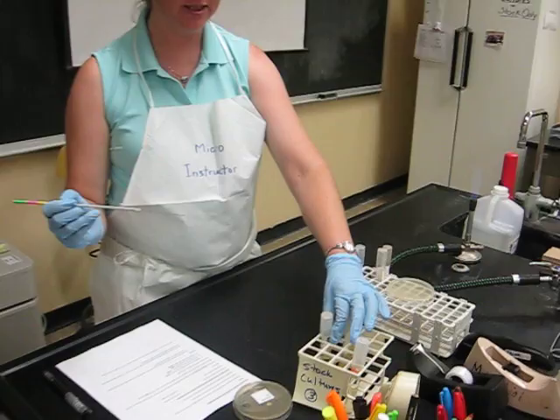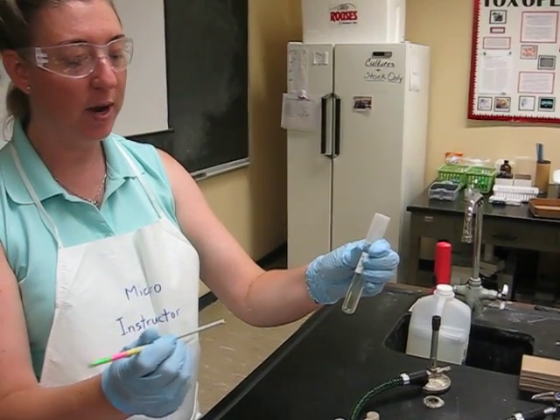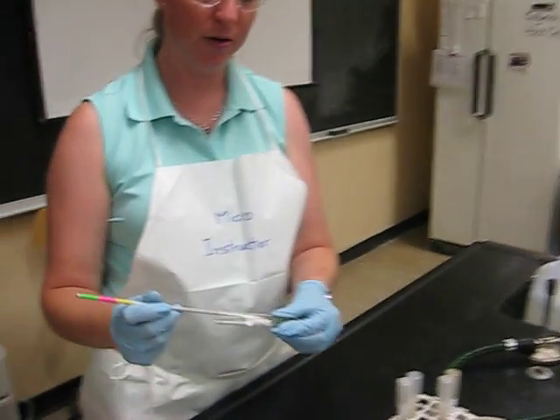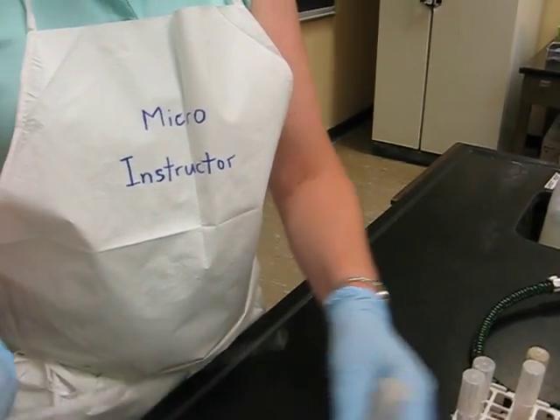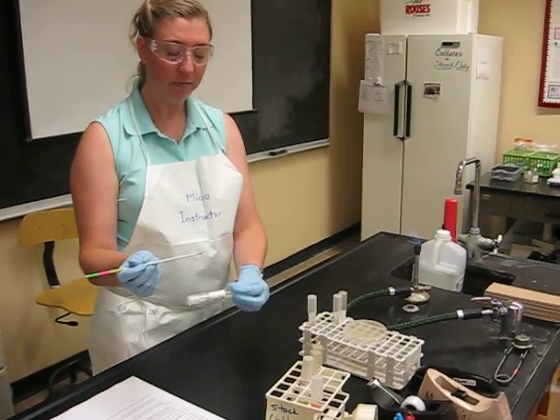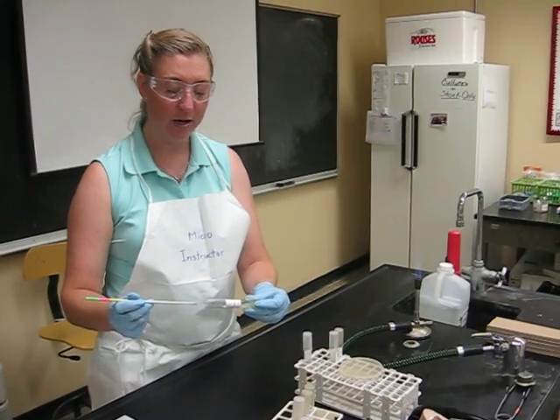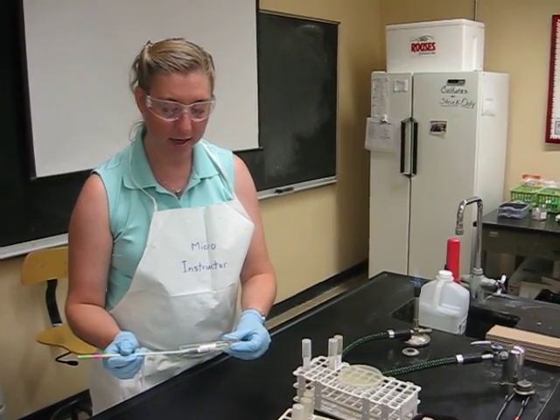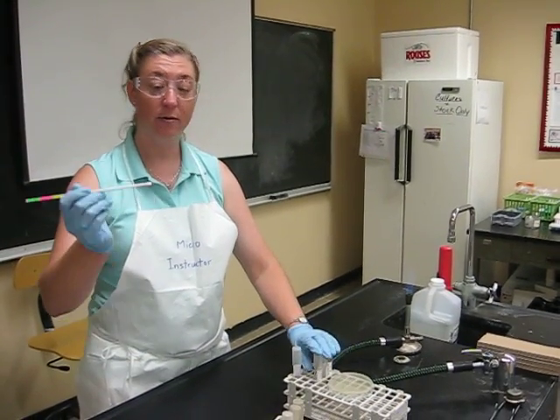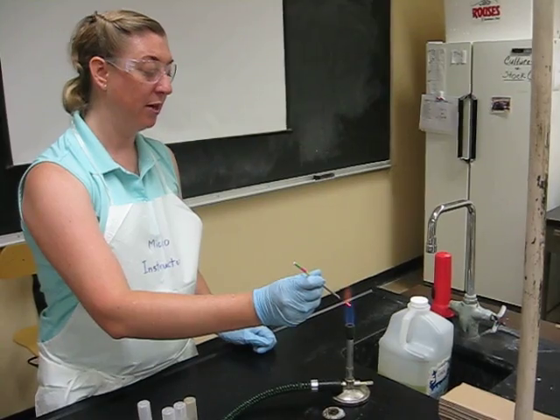The next one is E. coli broth — this is a little bit different. E. coli is a motile organism, so it didn't settle at the bottom; they're swimming all throughout. So if I just put my loop in, I'm going to pick up bacteria. Grab the cap, flame. Almost like you're blowing bubbles, just stick your loop in and pick up some liquid. It's okay if your bubble pops — the bacteria will still be on the loop, so if you have a shaky hand don't worry about it. I'm going into a slant — E. coli broth to slant. Grab the cap, angle it so I can see my slant. Go in without touching the sides, go to the bottom or butt, and zig-zag up the slant to almost the top. Lift it up, flame, cap, done. Flame my loop — this one won't have quite as much bacteria since it was a suspension, so it flames off quickly.